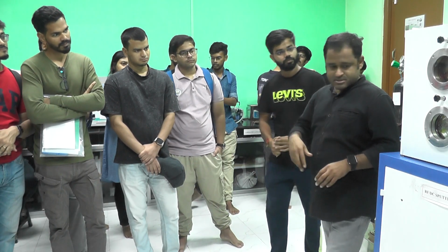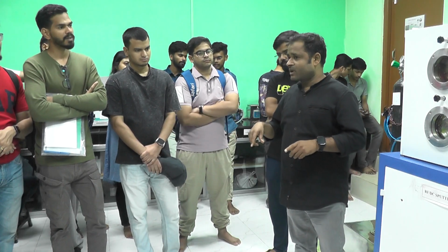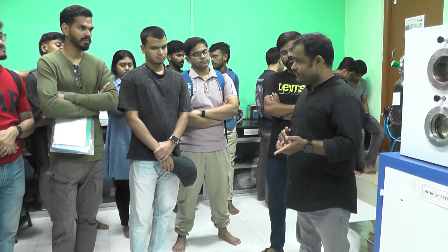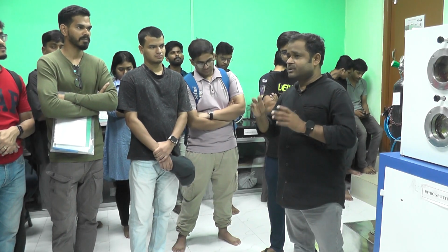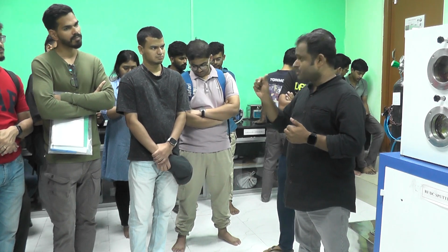And I wish to add here, you can do reactive sputtering also. Suppose you want to deposit titanium nitride. You have a titanium target only, so you have to pass nitrogen as well. You need to know the percentage of nitrogen.